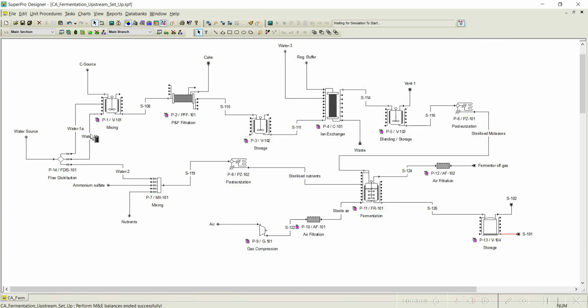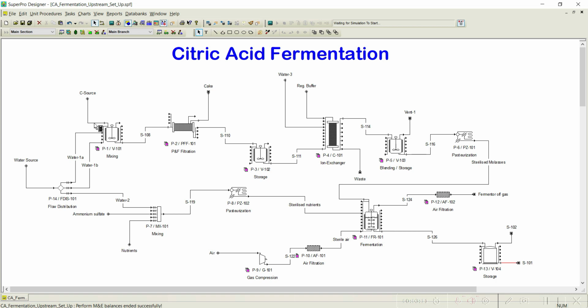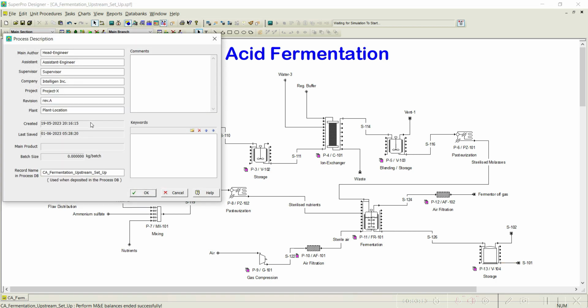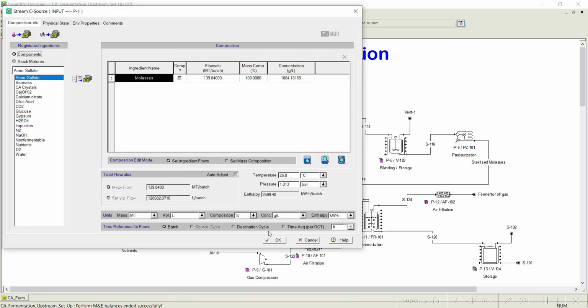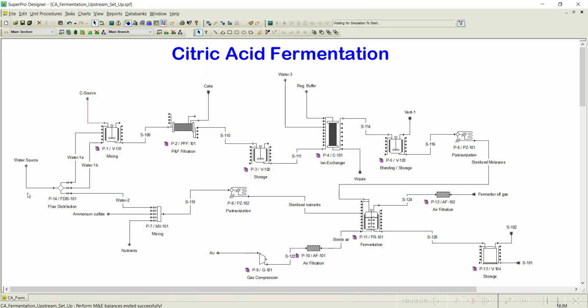You also want to check, for each case, the carbon source we had added, which is around 139.84 metric tons. The water source, actually we don't know, because initially we added 100 metric ton of water to this reactor, and we used some quantity to dilute this particular molasses, and also we used water to prepare this particular nutrient.